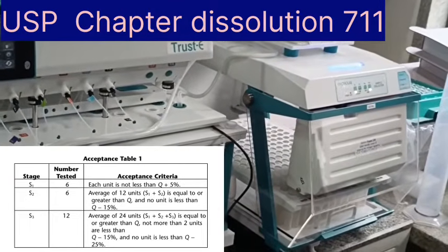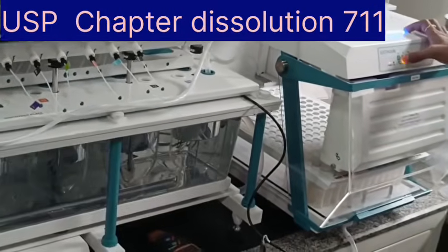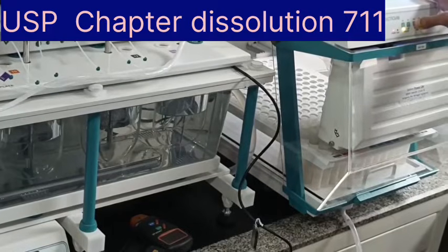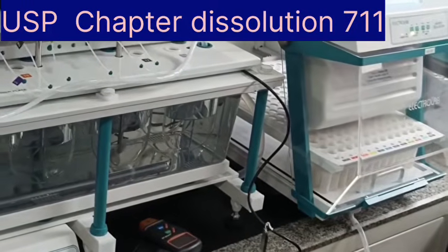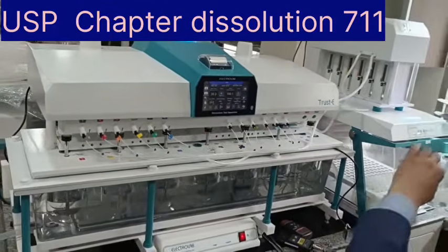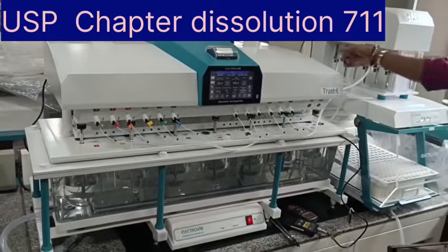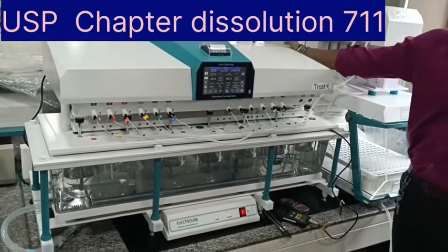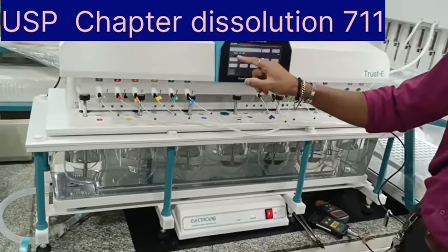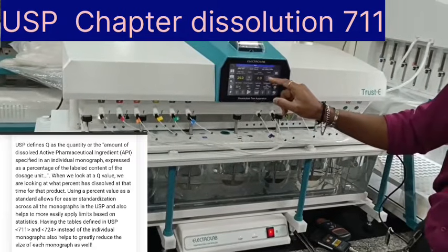Now the next point is very important, and I wanted to throw some light on this point as well. Why do we need to add 5% to the Q value at the S1 stage? You must have seen that at S1 stage, our specification for dissolution is not less than Q plus 5. So why has this 5 been added only at the initial S1 stage? Because if you go from S2 to S3, we only talk about average equal to Q, and there is no requirement of Q plus 5 as the average or as an individual dissolution unit.